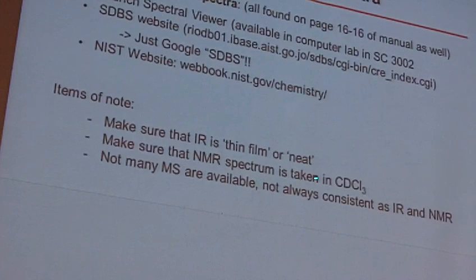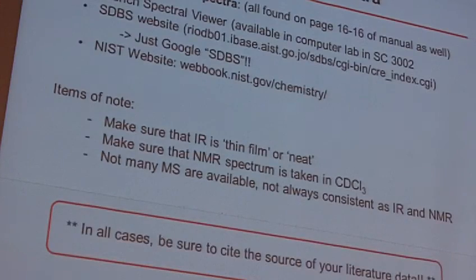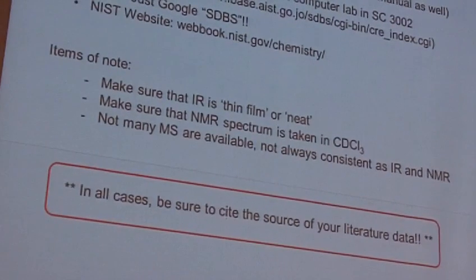For the NMR spectrum, be sure that it's the same solvent. One thing I will tell you is NMR spectra taken in chloroform should be nearly overlaid and identical. You can take them in a different deuterated solvent, and then all bets are off. Things move around, so be sure that you keep it the same solvent. And I will say mass specs are generally not terribly available. Some are, some aren't. Depending on the instrument and the type of system used, they don't always match in terms of intensity. So they can help as a suggestion, but definitely not like an overlaid match. And of course, be sure you cite the literature.